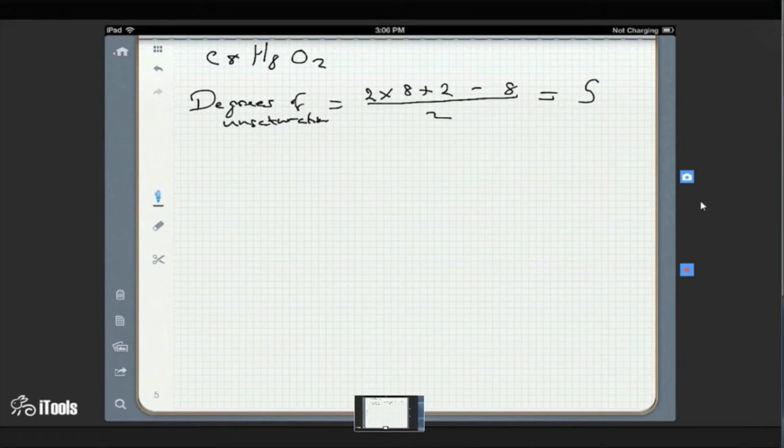It's just above 3,000 and just below 3,000. So, there's an aldehyde. Wait, hold on. Is that 10? If that's 10, that's an aldehyde for sure. So we can go ahead and write that, like, in the mass spec.